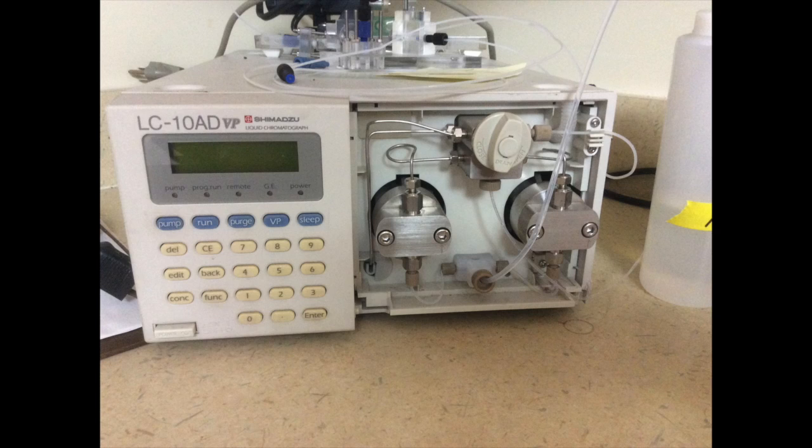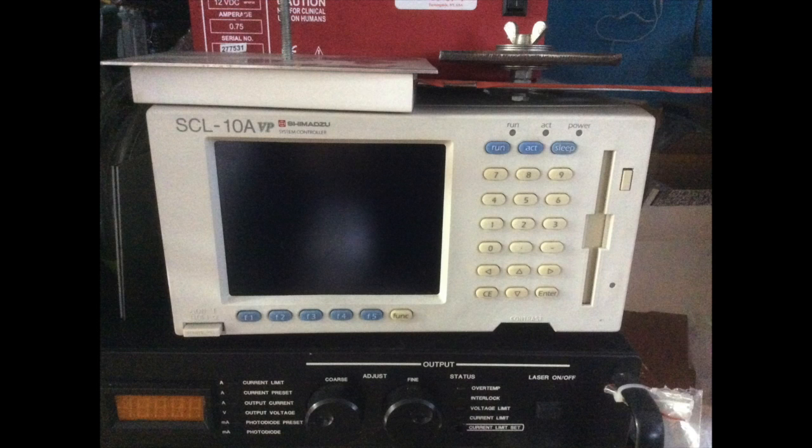Further, Andy has taken a closer look at the documentation for the Shimadzu HPLC pump and controller, and he believes that we have much existing potential here to automate this device as well for our process, a lot more than I expected in the beginning. All in all, it's been a very productive 10 days having both Andy and Zach working together in the lab.